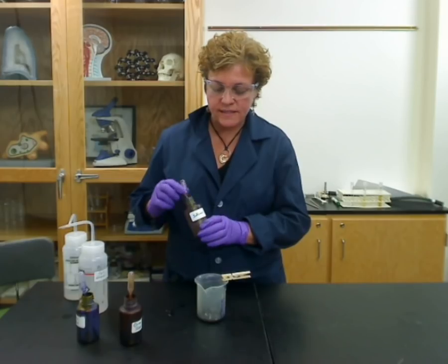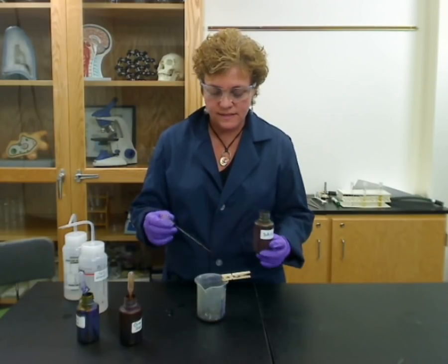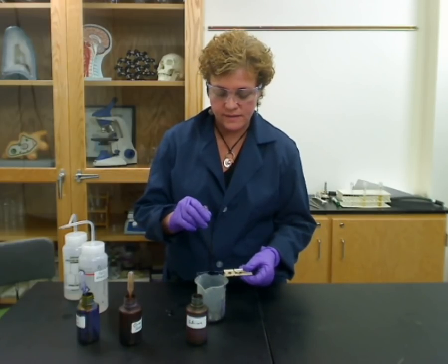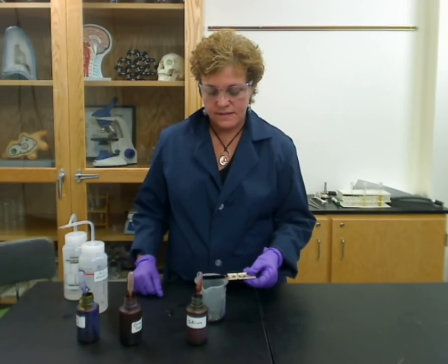The next thing you're going to add is something called the counterstain, and the counterstain is safranin. Safranin is red, and once again you're going to flood the slide and wait for a minute.